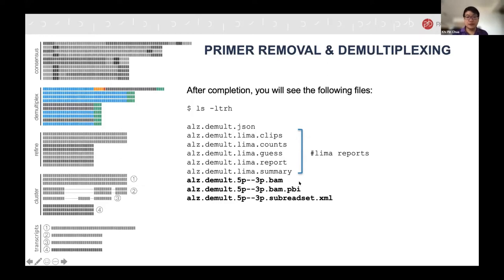After Lima completes, you will see the output BAM file after primer removal, an index file, and the XML file. Note that Lima also generates report files — these are useful for troubleshooting if the final demultiplexed file is not as expected. For example, we have seen customers forget to add TSOs, and those library artifacts will show up in the Lima reports. If your data quality is not good, the conversion rate will be low and that can also be seen in the Lima file. Otherwise, you take the BAM file directly into the next step.